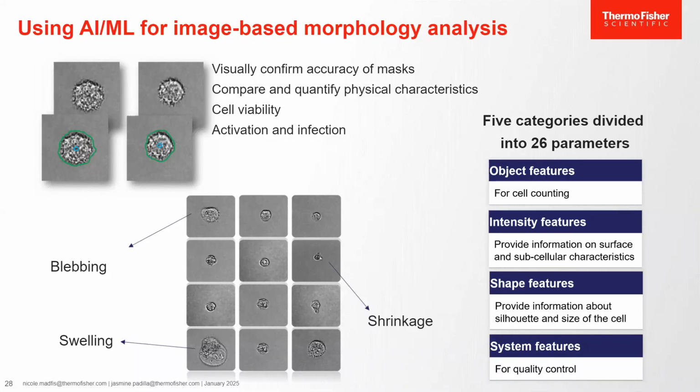The image processing model allows the identification of objects in the foreground of an image and measures specific patterns and characteristics within the image, and then transforms the image data to digital data. The digital data are characterized as morphology parameters, and we've divided these into 5 feature categories.